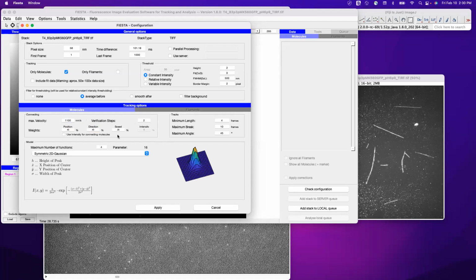The weights are, so this is for keeping it one track, right? Yeah, so after your file is stored, once you analyze, you will see it connecting the tracks. That's what this range effect is. Yeah, so most of the time the defaults work relatively well.